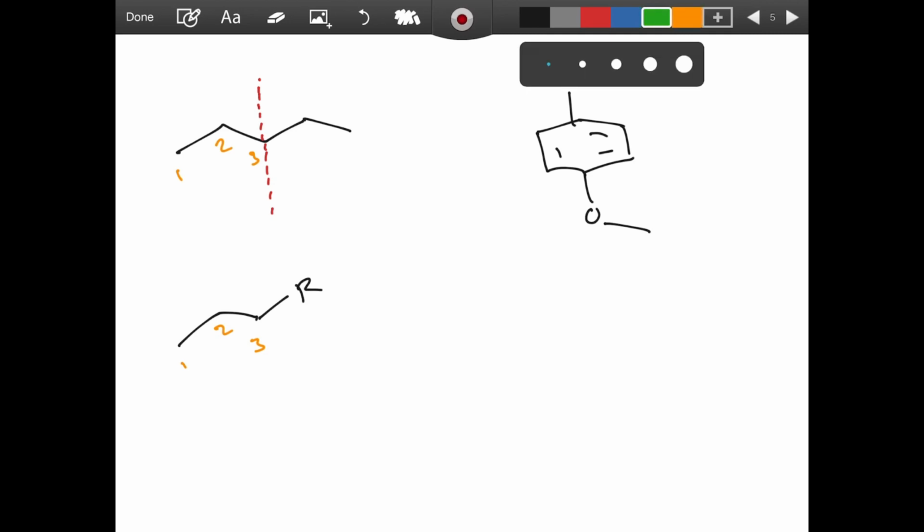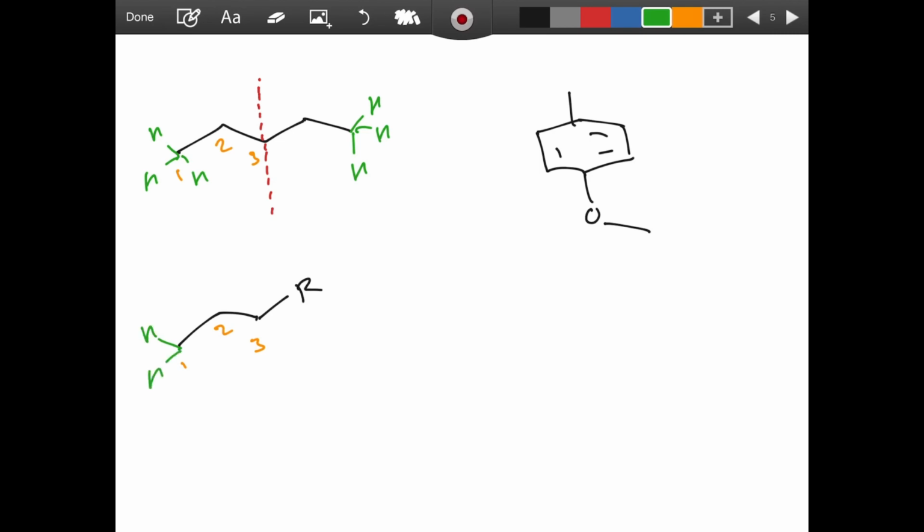So the NMR is going to say, hey, these hydrogens here on carbon 1 and these hydrogens over here, those are exactly the same. I'm going to just see basically this set of three hydrogens here that is green, but I see 2 of them, right? These blue hydrogens here on carbon 2 are the same as these hydrogens over here.